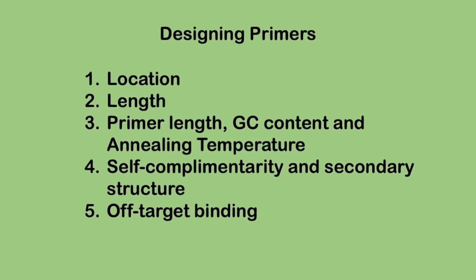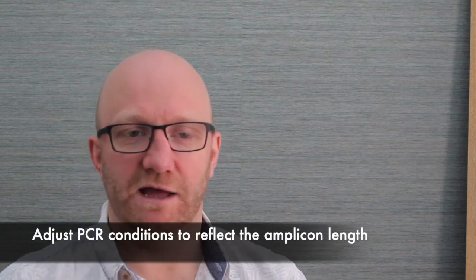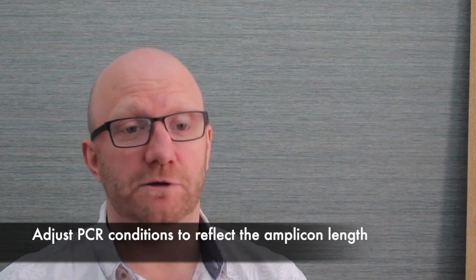Okay, location aside, next you decide on the length. For quantitative PCR, it needs to be quite short, under 200 base pairs. But for endpoint PCR, it can be as long as you need it to be. But remember, as the length increases, the reaction becomes more difficult, and you'll need to adjust your conditions to consider it. Amplicon length will also influence your cycle conditions. So once we talk about what goes on in the machine, you need to think about that.